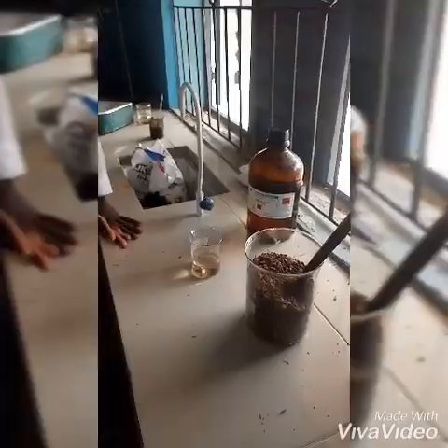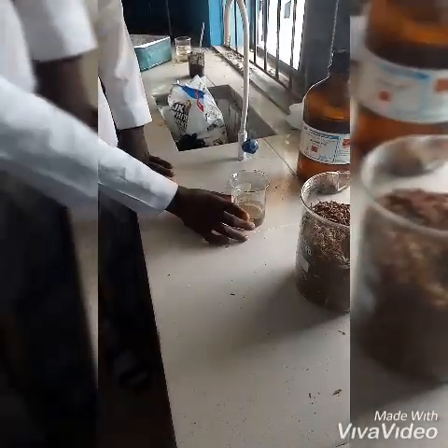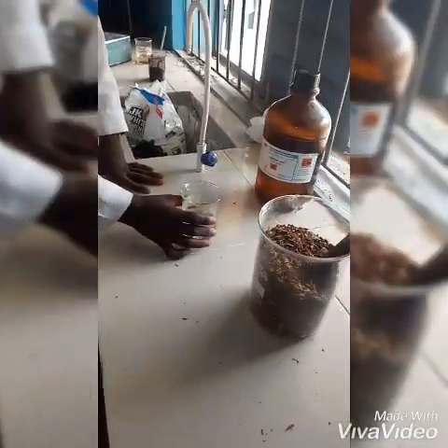We are about to use our concentrated acid for proper activation. This is 100 ml of orange peel — 100 ml is what we should take. I'm going to mix them.